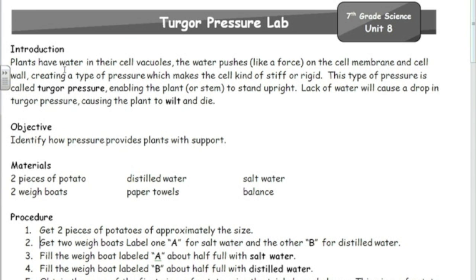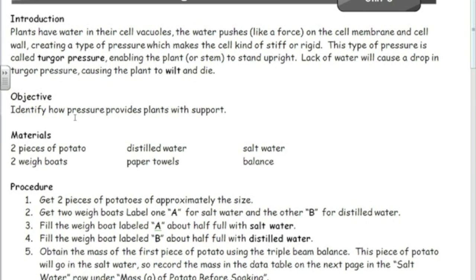So at this time, go ahead and pause the video. Go read the introduction section of the lab, answer the pre-lab analysis questions, and then when you're all done, come back and unpause the video and we'll continue on with the lab. Okay, we're back. Hopefully you read the introduction section and answered those questions. Let's go on and go through this lab.